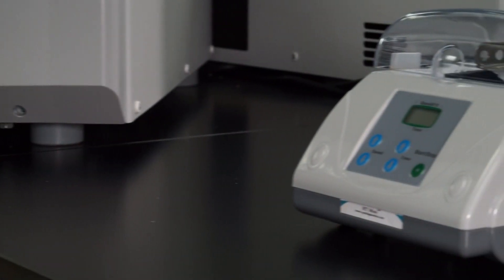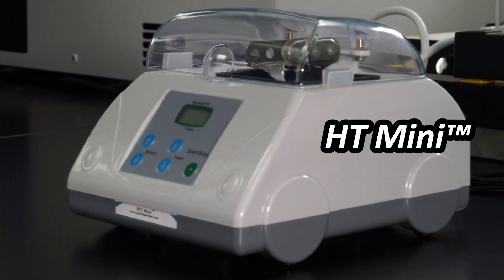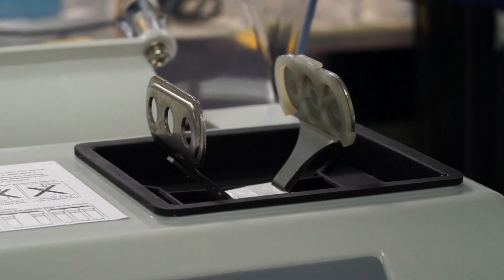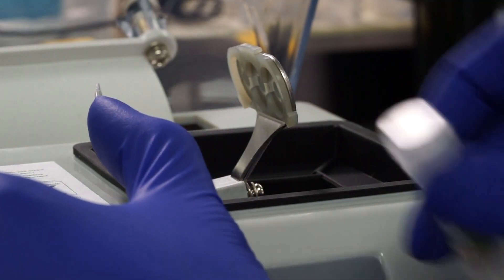One of the smallest homogenizers on the market, the HT-Mini has enough power to effectively homogenize three non-skirted disruption tubes per cycle for up to 60 seconds. What it may be lacking in throughput, it more than makes up in versatility.